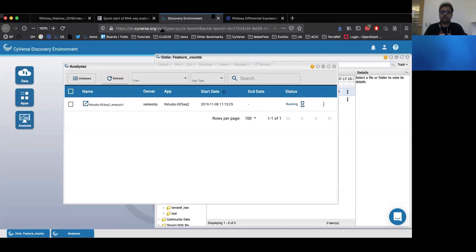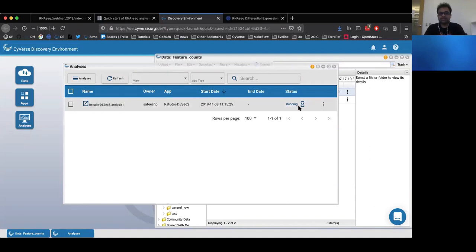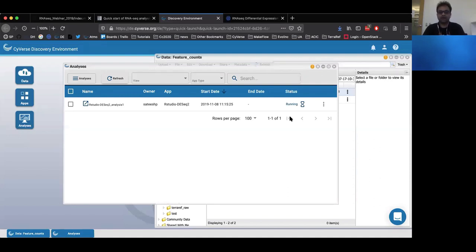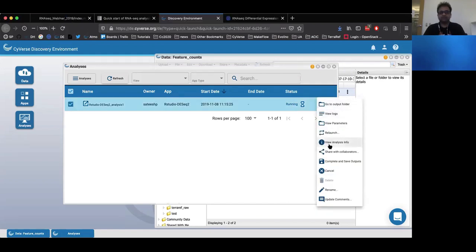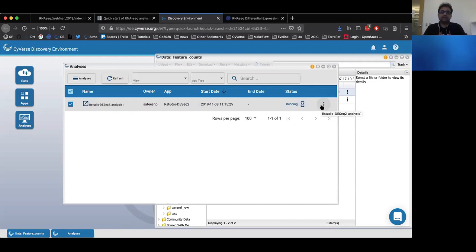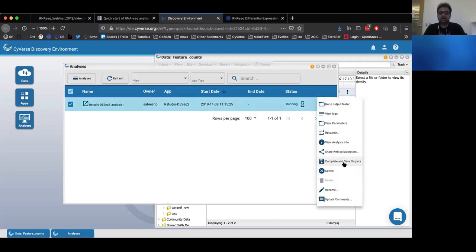Once you are done with the exploration of your data, go back to your discovery environment. By clicking on the analysis tab, you can see that this particular DESeq2 analysis is still running. Because it's an interactive app, there is a time limit — the default is 48 hours — but if you need more time exploring your data, you have the option of clicking the hourglass button to extend the time limit. Once finished, to save and complete outputs, click on the three buttons next to the analysis and select 'complete and save outputs.'